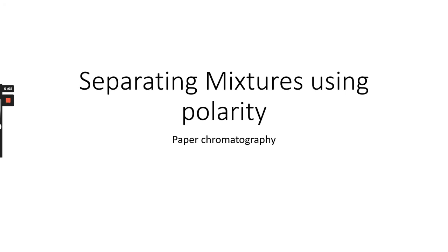Hi, welcome to a special video on separating mixtures using polarity, in particular how we use paper chromatography.